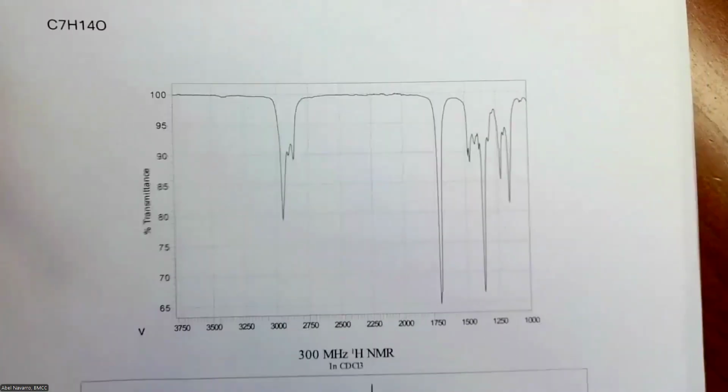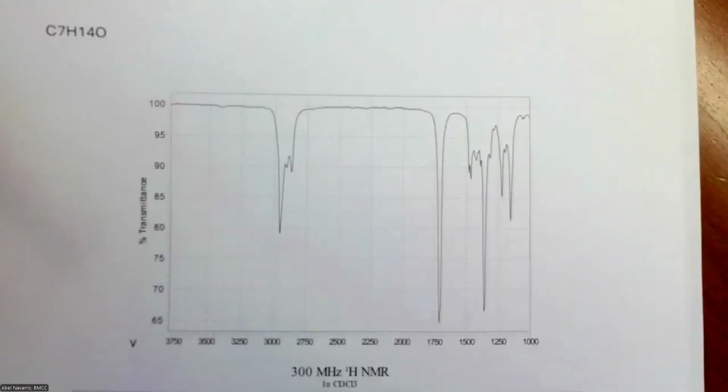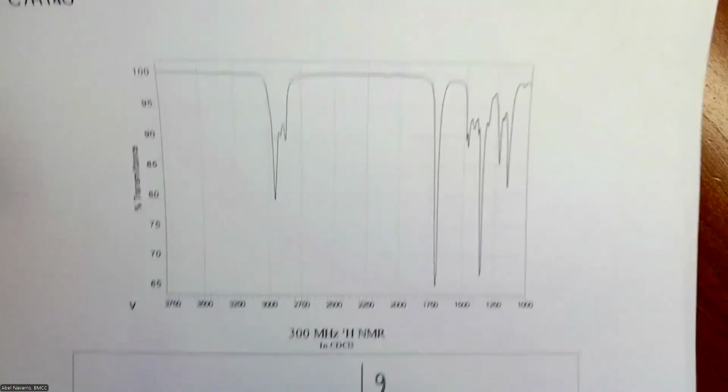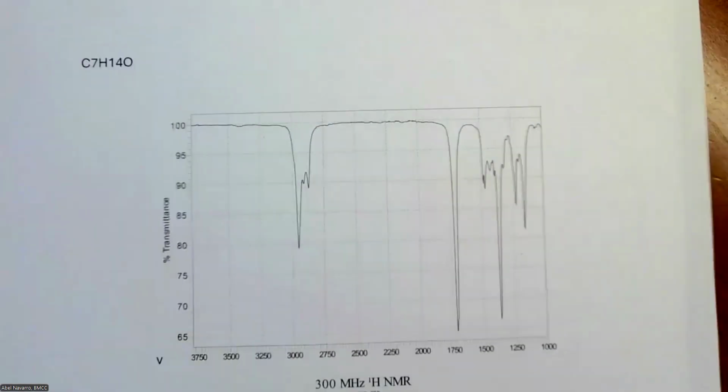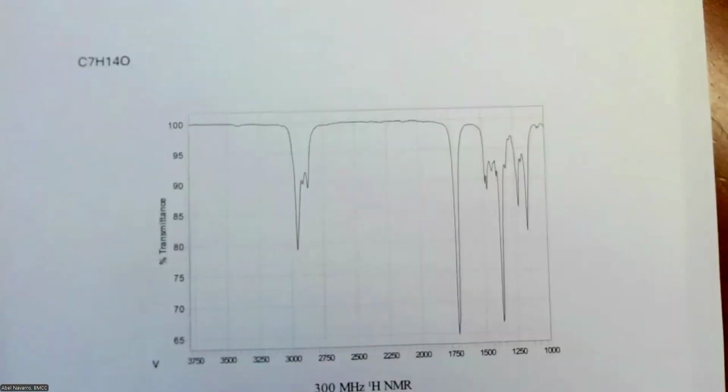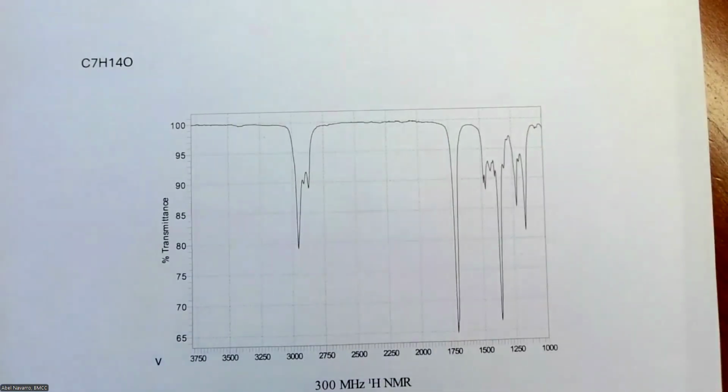You guys most likely for the exam and the quiz will receive this combo, meaning the IR peaks and the NMR, the two. Oh, but professor, we just did analysis with NMR. We didn't need IR at all. Yes, it is true. You don't have to, but the idea is really to use both tools, both techniques, to elucidate the structure of a particular compound. Okay?